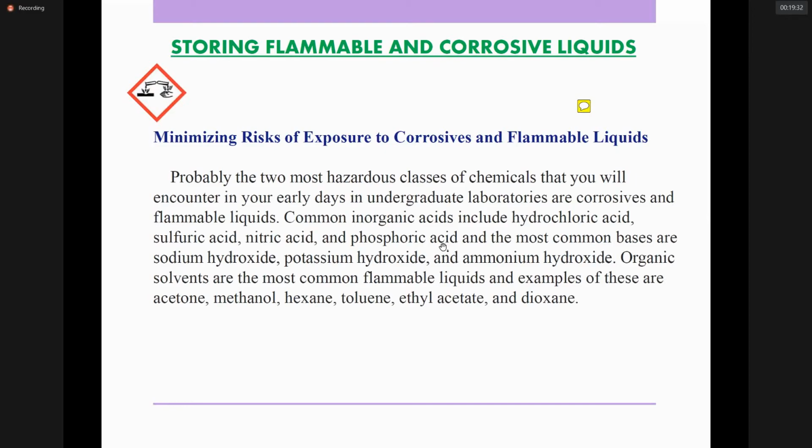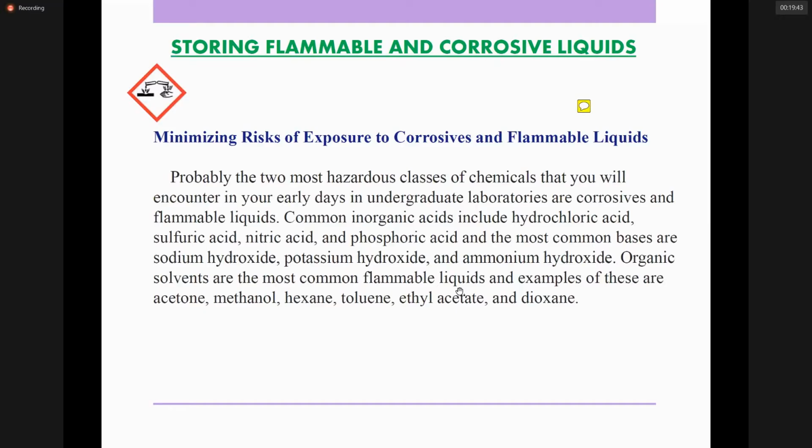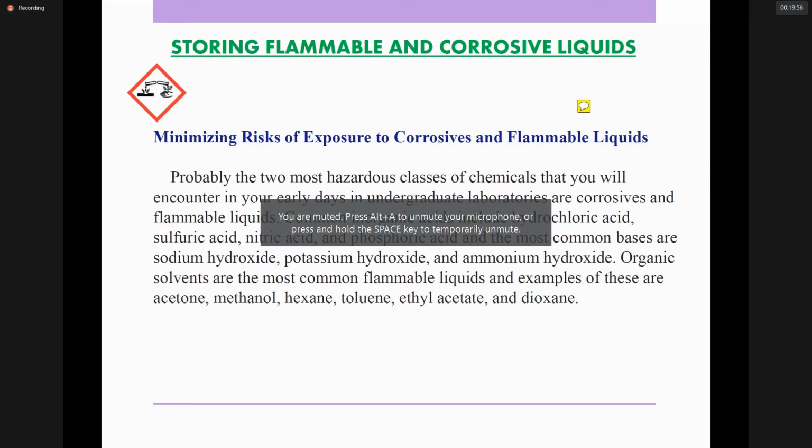Also bases, commonly sodium hydroxide, potassium hydroxide, and ammonium hydroxide. Organic solvents and flammable liquids such as methanol, acetone, hexane, and ethyl acetate are all classified as flammable liquids.